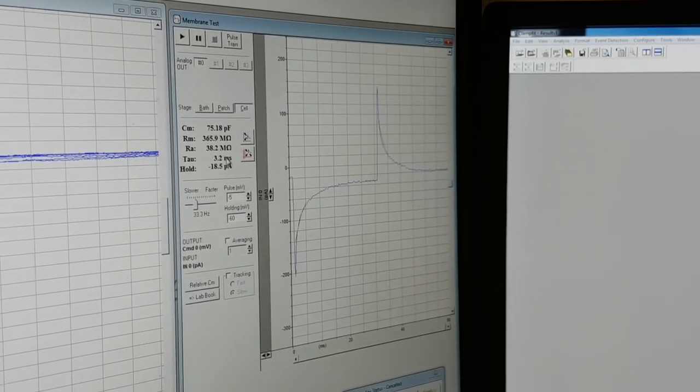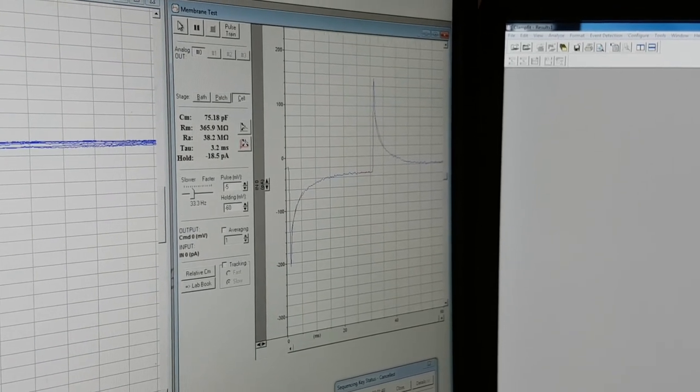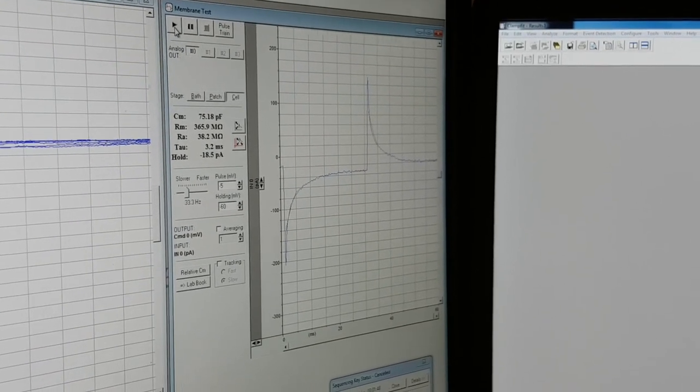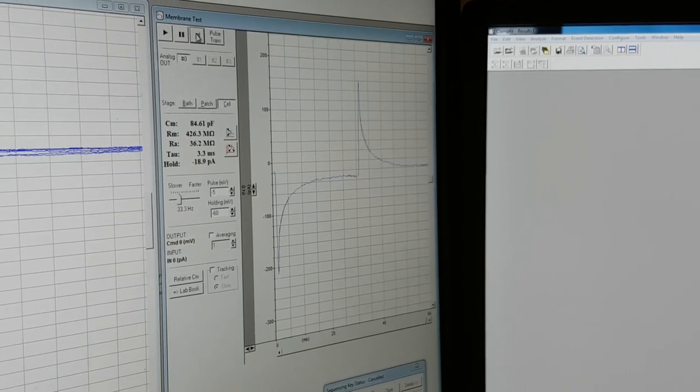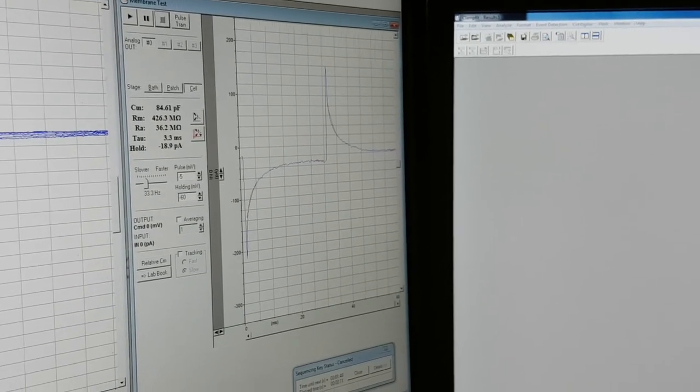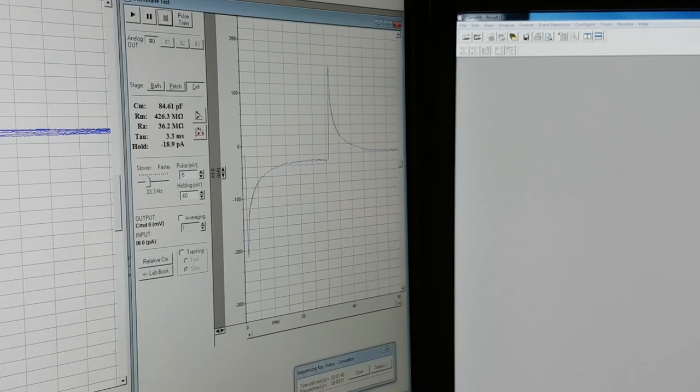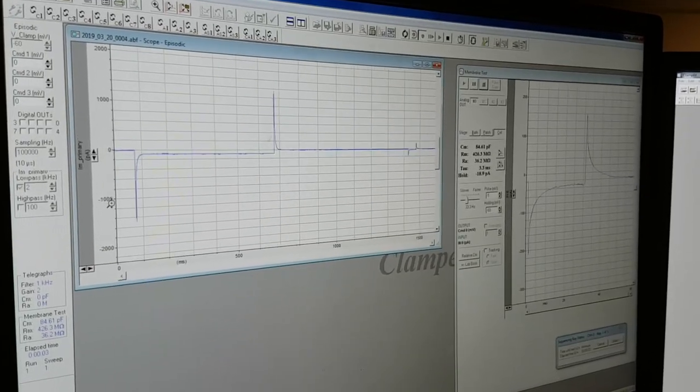In our voltage clamp experiments here, we will hold the membrane at negative 60 millivolts. Additionally, once we've broken into the cell, we can switch our membrane test to the cell mode and record the baseline parameters as seen on the screen. This includes the membrane capacitance, the membrane resistance, the access resistance, as was mentioned earlier, indicating the lower the better, typically, with a range of less than 40 mega-ohms being satisfactory and less than 30 mega-ohms being considered good. Also, we can record the tau, which is also referred to as the decay time. If we are satisfied with these baseline parameters, we can then run an IV curve.